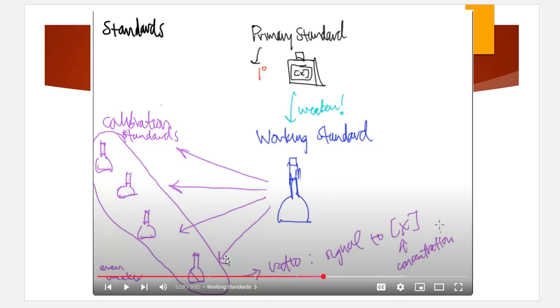That is perfectly okay. It's another option, right? Because the primary dilution might be too strong. And if so, that's fine. We weaken it down until we get to a point that's workable and manageable. So if we've got to make it weaker again, that's okay. But some people might call that the working standard now, and that one will make all of our cal curves.